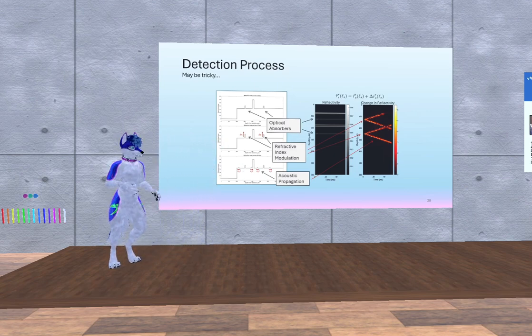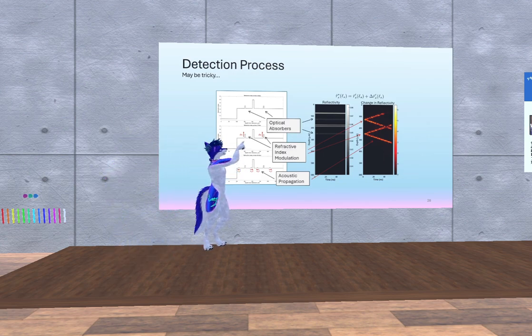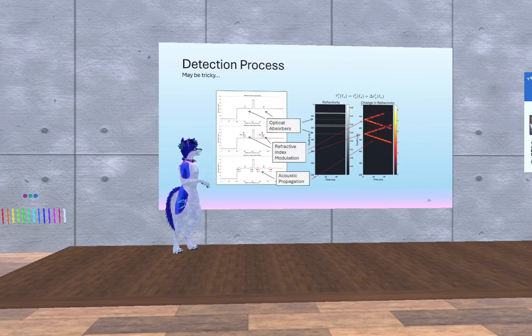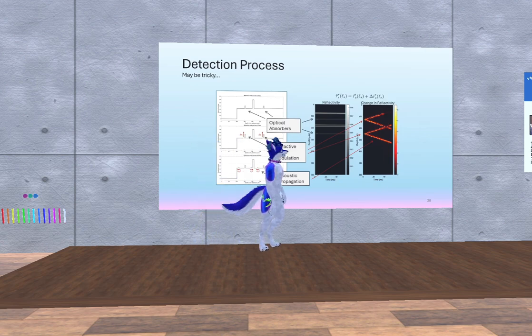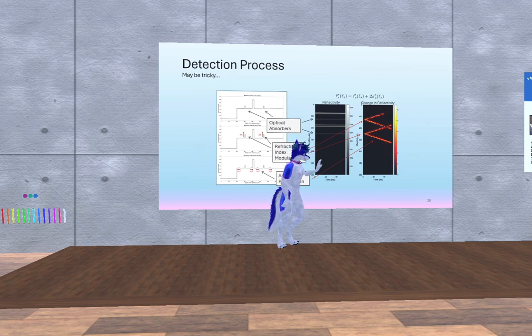If we excite this whole thing, you can imagine we've created a pressure rise, and we've created a little perturbation in the refractive index. We're plotting the refractive index profile in depth. We create that pressure rise at those absorbers, and then the pressure is going to flow away from those absorbers. Seems pretty straightforward. If you simulate how an OCT would see this whole process, looking at the OCT itself throughout time, so now we have time and depth, and again you have the absorber and the absorber, these gray lines in here, it doesn't look like anything.